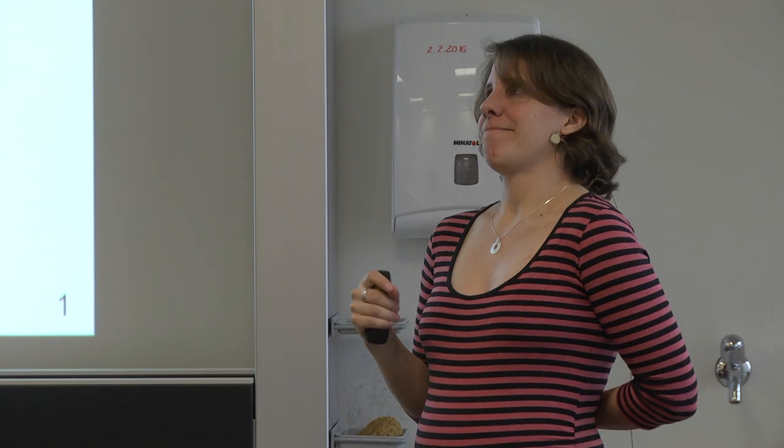Super, thanks. MSstats is this software by the Olga Vitek group that you will work with, and you will learn one very sophisticated way to combine peptide ratios and also transition ratios into a final protein value. But you're right, it's a very important point, and I'm always happy to skip that and just focus on the peptides, because it's a big problem and it's often not really addressed in papers or in the field, even though everybody who deals with proteins has that problem.